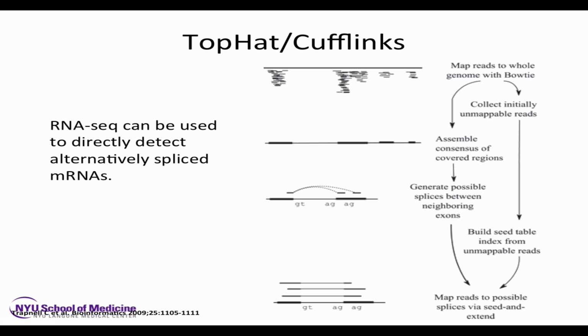All right, I've talked about the mapping. We're going to use a tool called TopHat to do the mapping. You might know something about sequence alignment. You take one string of letters and you match it to a second string, and you slide them back and forth. You introduce gaps, and you allow a certain amount of mismatches, and you find the optimal frame of alignment.